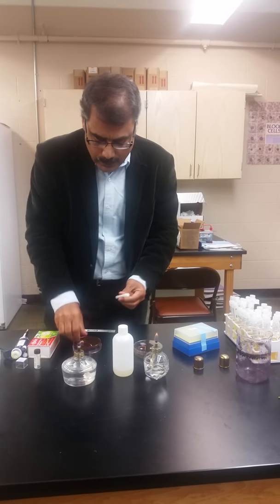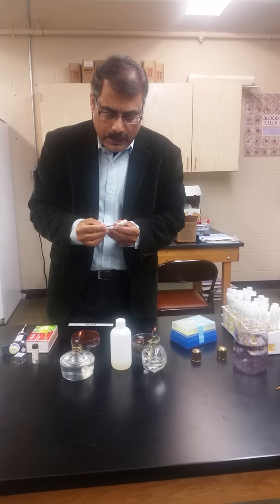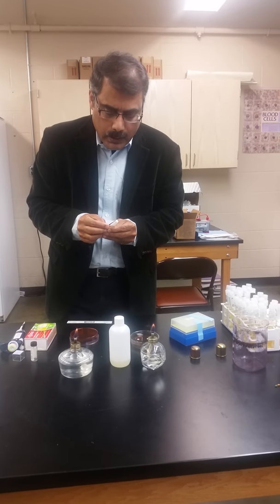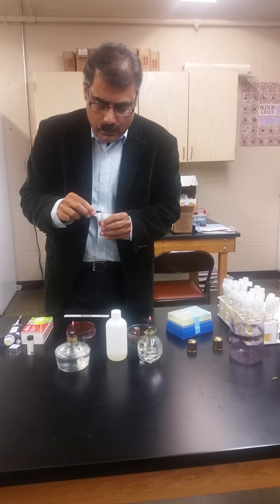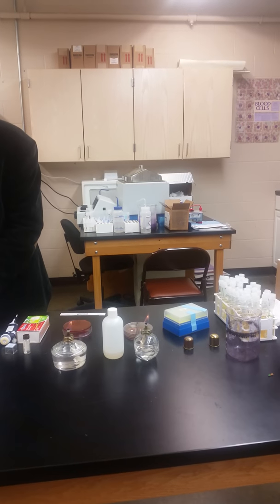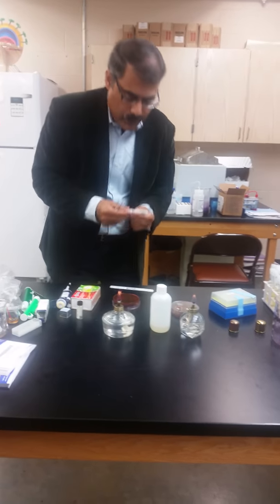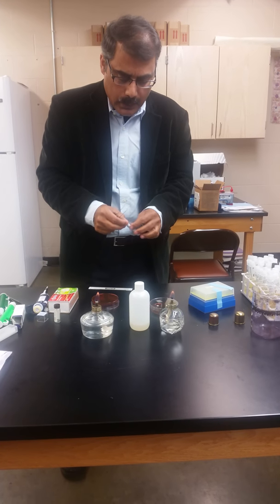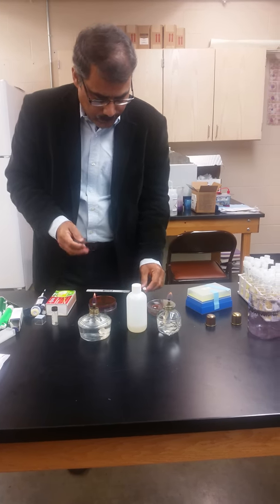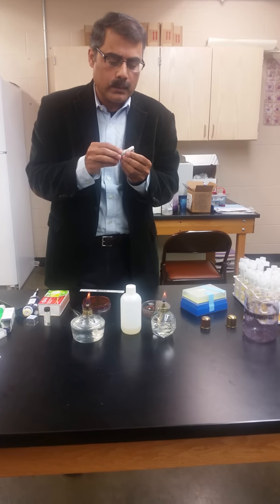Now remember that when you are using a selective media, you are selecting for a group of bacteria. Okay? So sometimes they get loose. I have neomycin and streptomycin, and this is an erythromycin. Which one of these somebody has used? Vancomycin. It's used a lot.